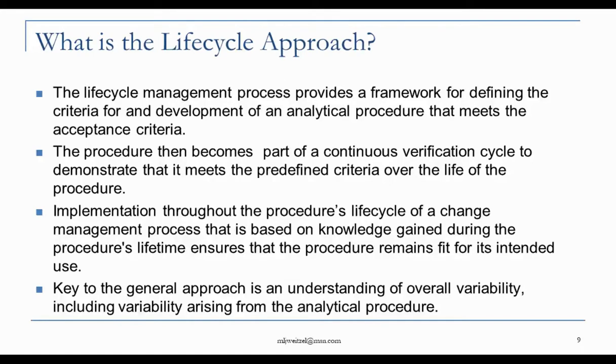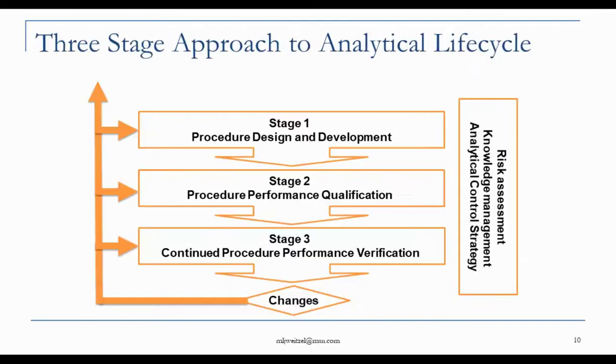Implementation throughout the procedure's life cycle of a change management process that is based on knowledge gained during the procedure's lifetime ensures that the procedure remains fit for its intended use. And that fit for its intended use is important. We'll see that more and more and more. And how you define that intended use is all explained in the life cycle approach. Now, key to the general approach is an understanding of overall variability, including variability arising from the analytical procedure.